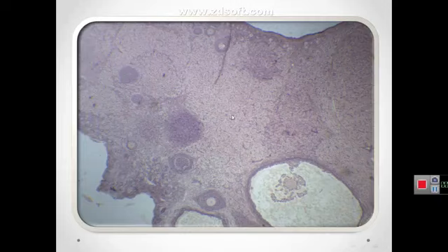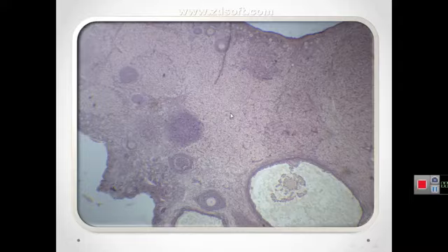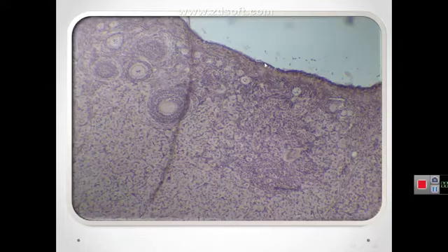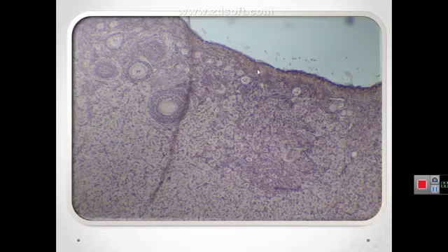The most internal part of the ovary, the medulla, contains loose connective tissue and blood vessels. Each ovary is covered by a single layer of simple cuboidal epithelium called the surface or germinal epithelium, overlying a dense connective tissue capsule called the tunica albuginea.